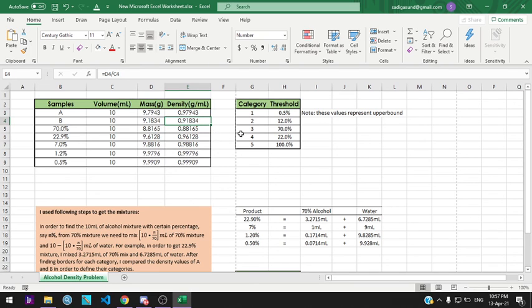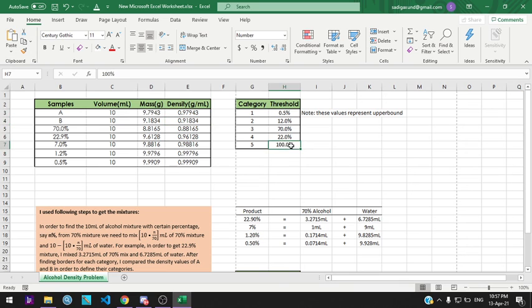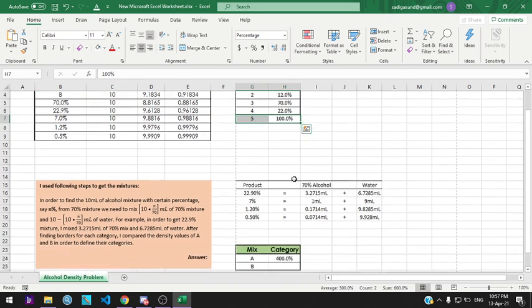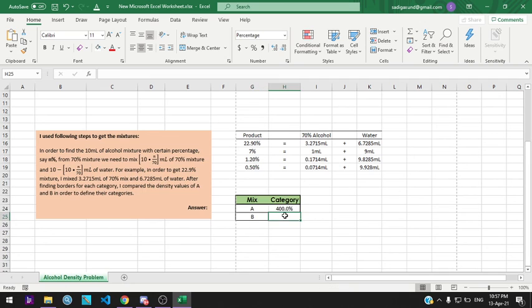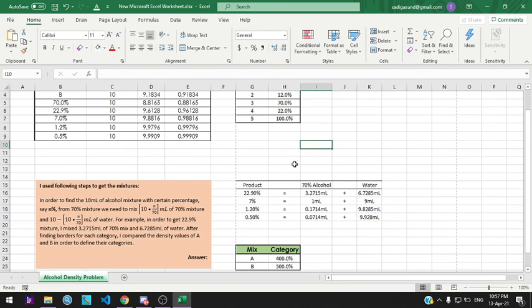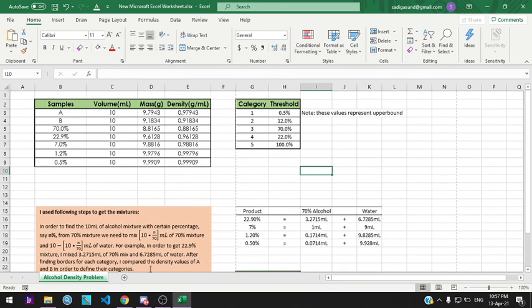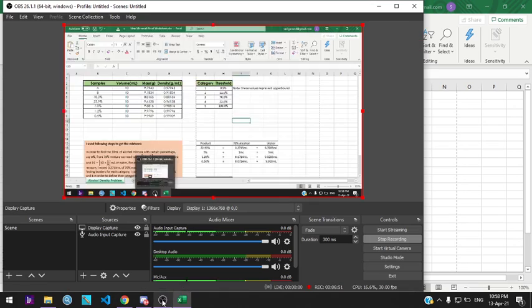It is more than the 7% sample and less than the 22.9% sample, which gives us category number five. If we record that to the data, we will get the answer. The data sheet is ready to submit.